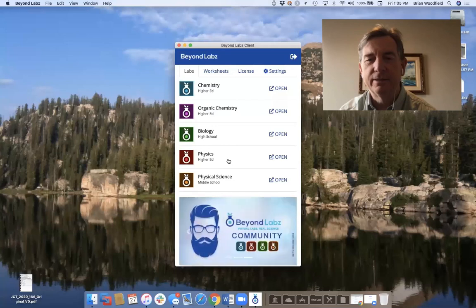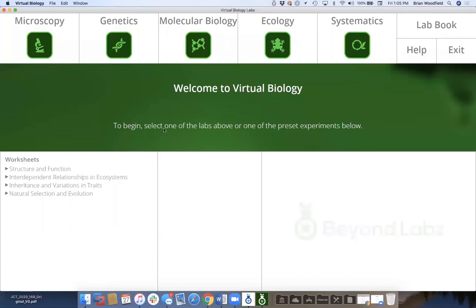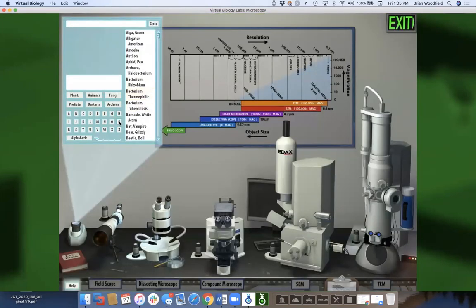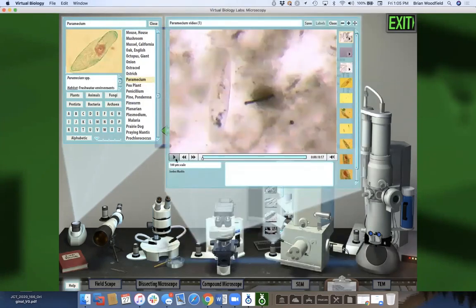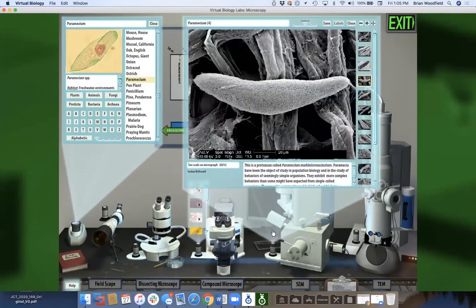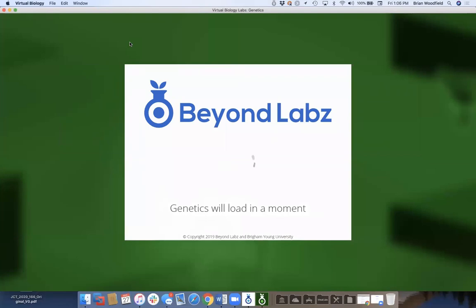Let me show the biology opening screen again. In microscopy, if I come to Paramecium I can show videos from a compound scope. I can also come over to an SEM microscope — we took all these SEM micrograph images at different magnifications.